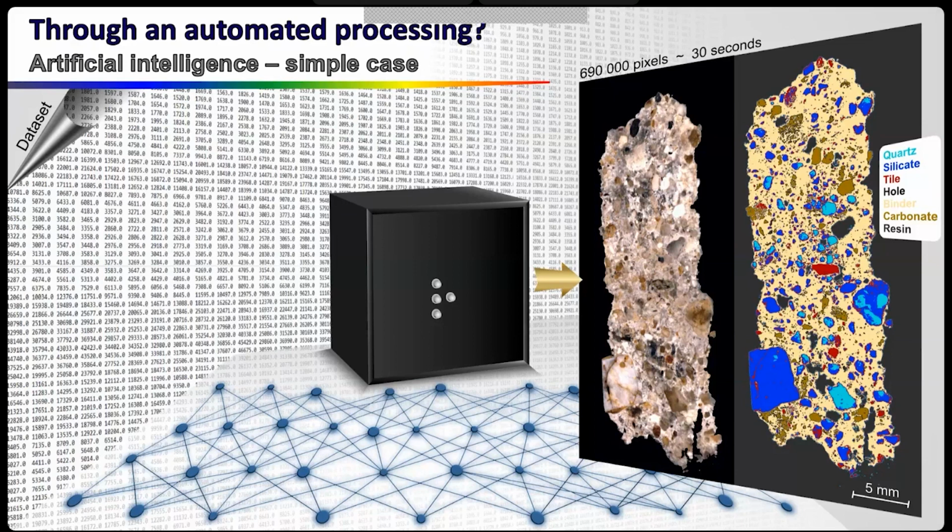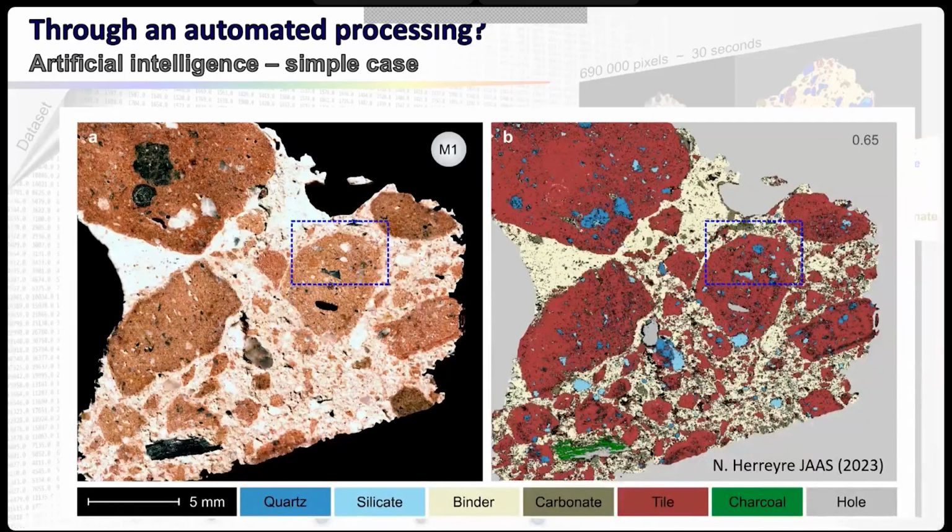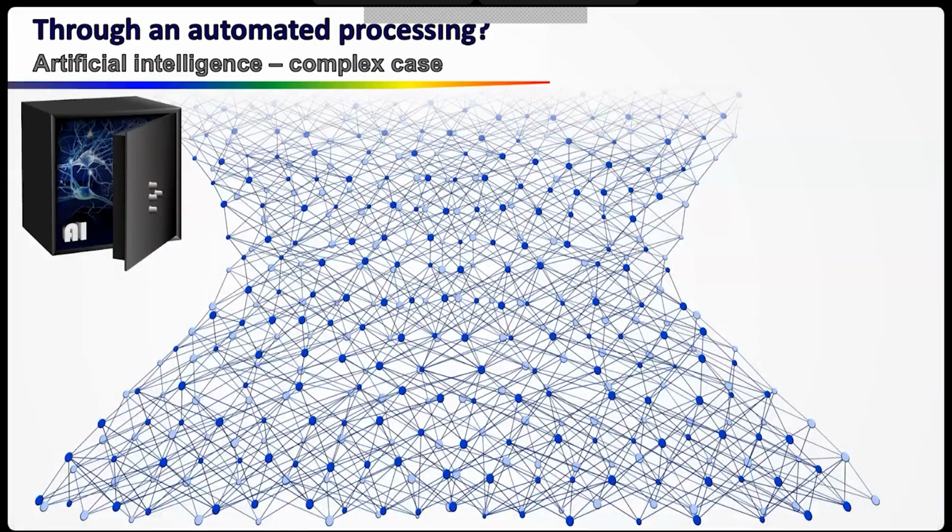And more importantly, this result was recorded before COVID. And we applied exactly the same algorithm to this sample that was recorded after COVID on a different instrument. And we got perfect results. So this method is very robust. So now I will give you the best idea I never had.